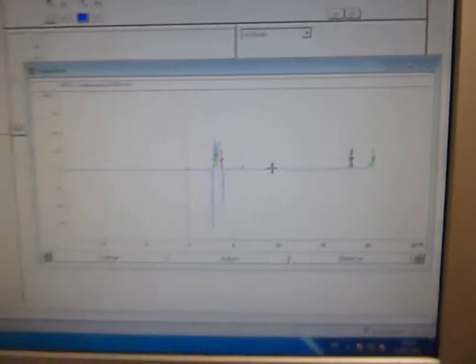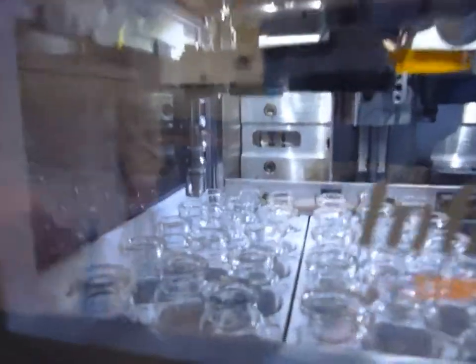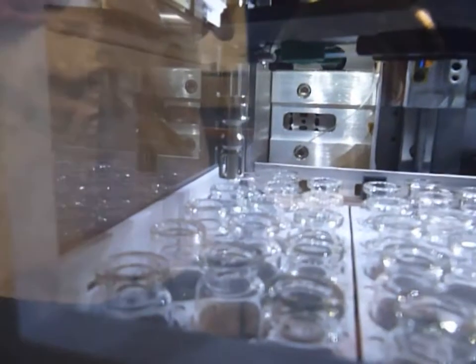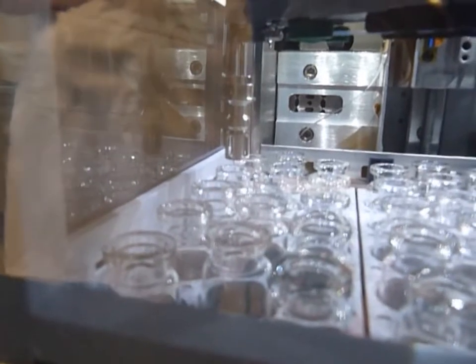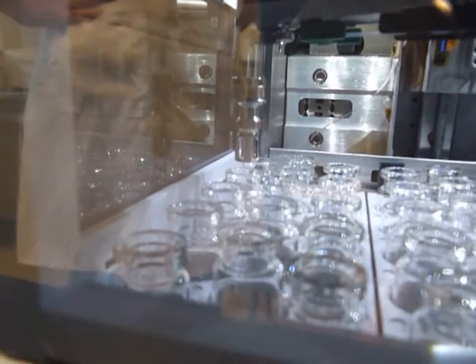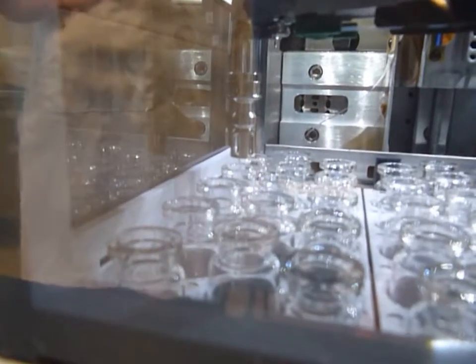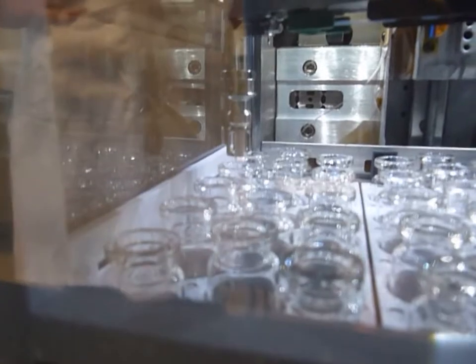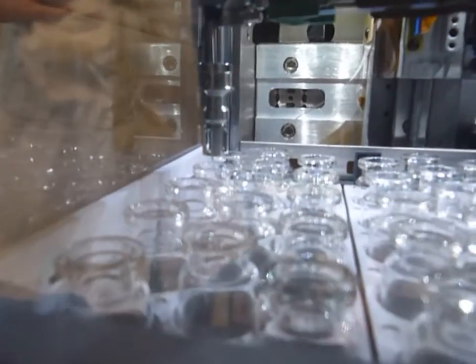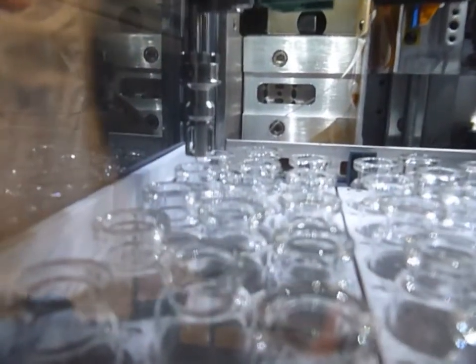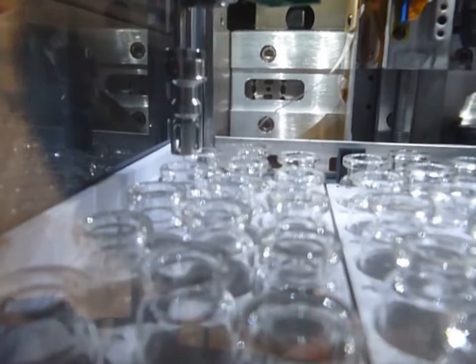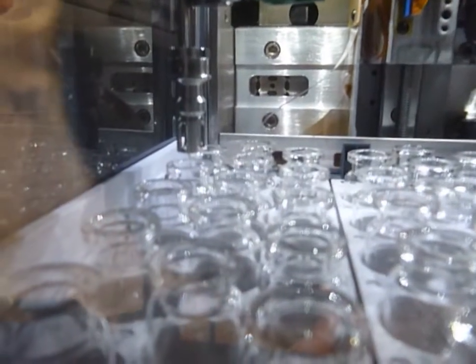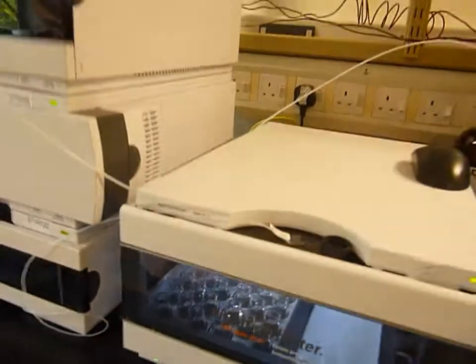If you look in here now, you can actually see the drips of the fraction being collected. Sometimes it collects two or three fractions over one peak. At the end of the run, if you want to see your purity, you would then reanalyze those bottles and usually freeze dry your product to give you pure material.